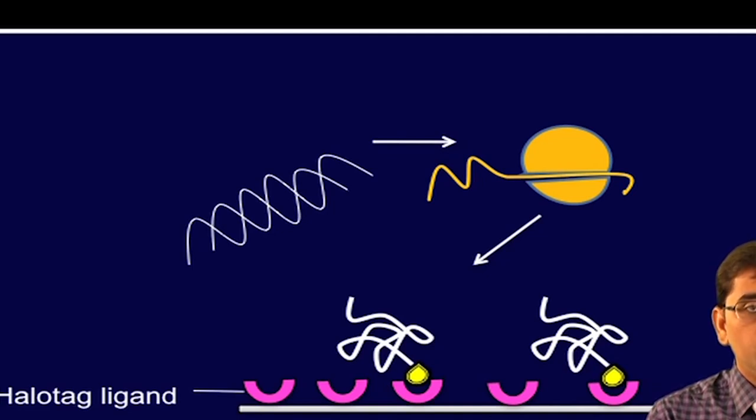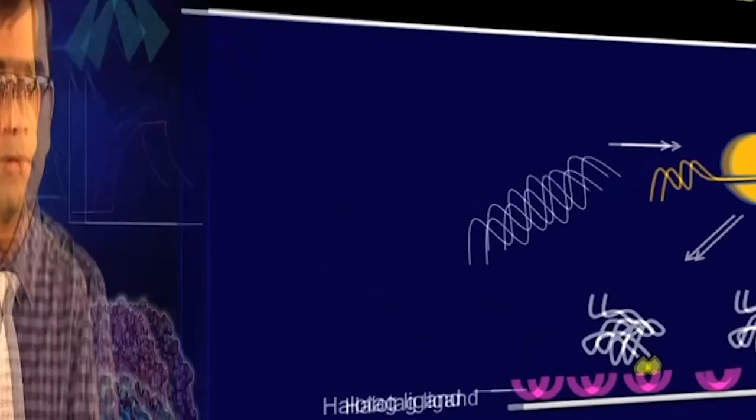In protein arrays, one needs to perform several washing steps. If the proteins or the molecules are bound on the surface with very strong interaction, then there will be minimal loss from the surface, which can be achieved in this case by using Halotag system. So, in Halotag arrays, the capture chemistry, which is based on binding of Halotag protein with synthetic ligand, enables covalent and oriented capture of proteins on solid surface directly from the cell-free expression based system. This method not only overcomes the limitation of protein purification, but also overcomes several other limitations which are commonly observed in any protein microarray technology.